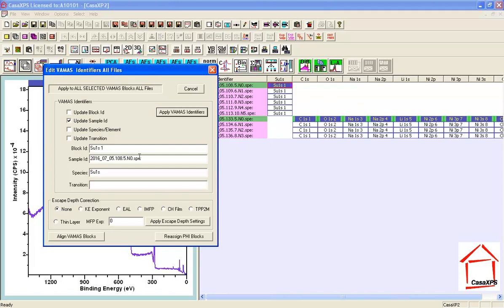I'm just interested in the sample ID. This is a distinct string that can be used to organize data in rows with respect to the sample ID. So I've entered N0.